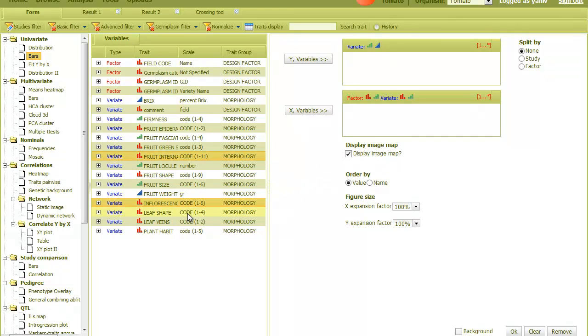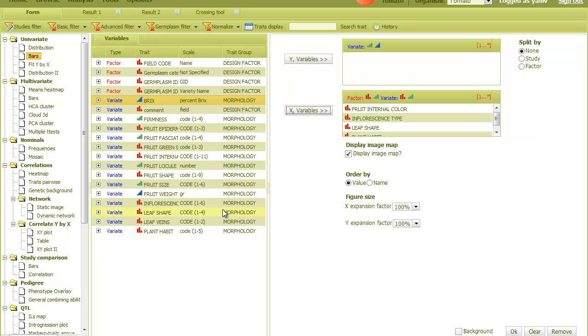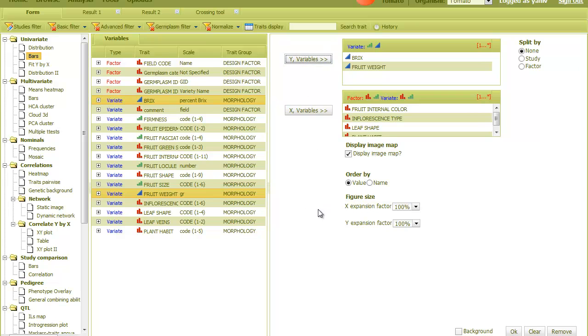And then some continuous traits, represented by the blue icon, in the Y field. This will compare all X variables with all Y variables. And then OK.